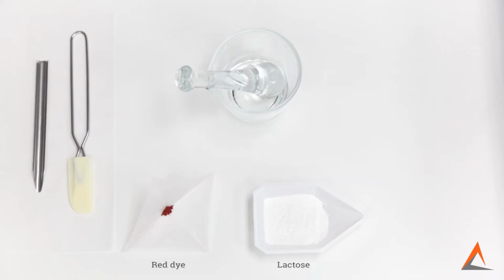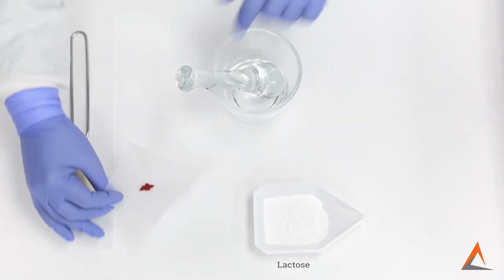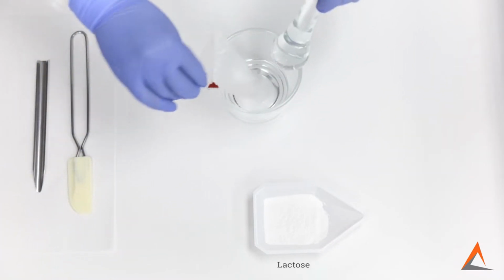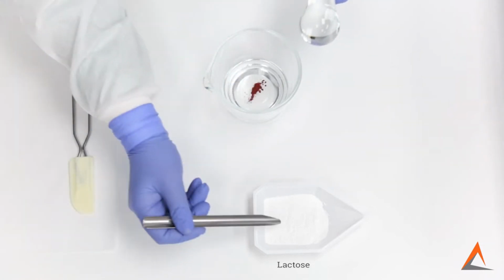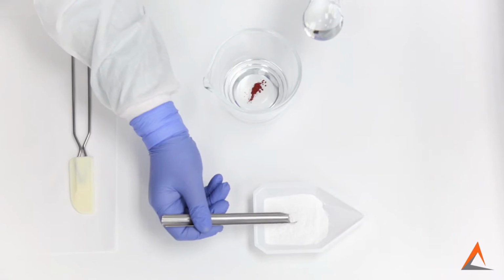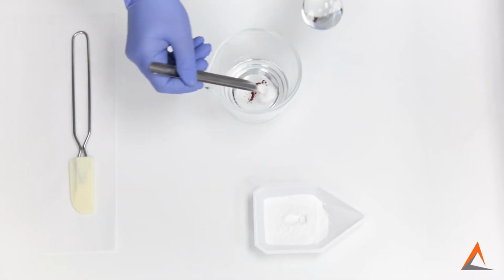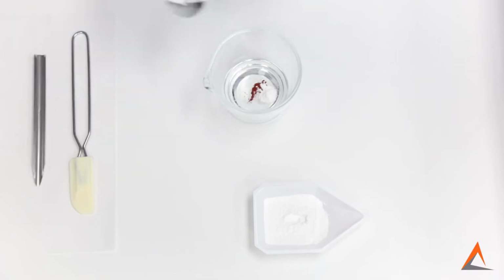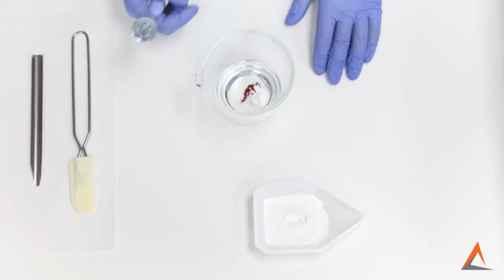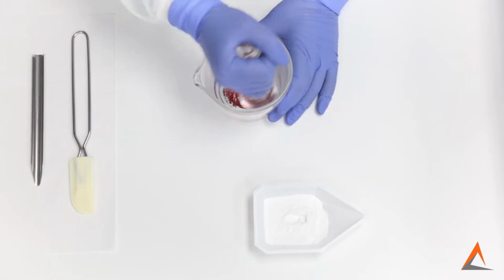We'll start by adding the ingredient of the smallest quantity into our mortar. Next, we add an approximately equal amount of the powder with the larger quantity into the mortar. This quantity does not need to be exact and can be eyeballed. Once we have approximately equal quantities of both powders, we're going to go ahead and triturate the powders.